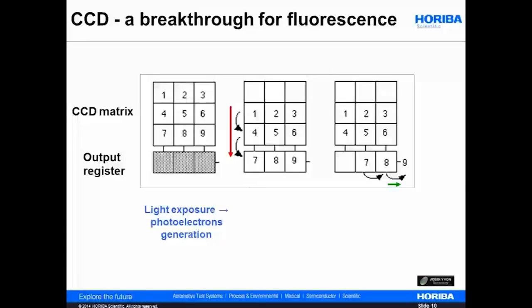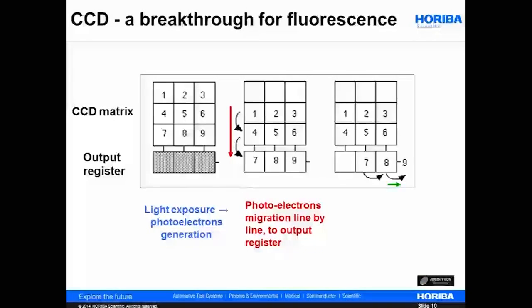Those pixels are defined by means of an electrode network which covers the surface of a CCD. The electrodes form potential wells to prevent the collected charge from escaping. When the collection of the charge is finished, the transfer is realized by changing the potential of each electrode in a synchronized way. Therefore, electrons can move from pixel to pixel and finally to the counting device at the end of each line or column.